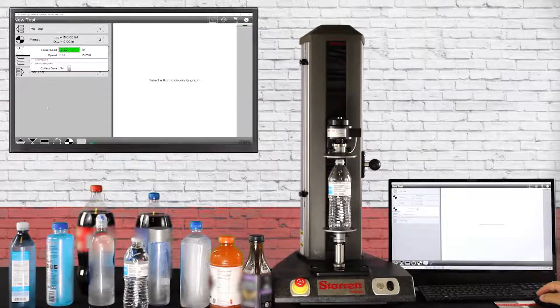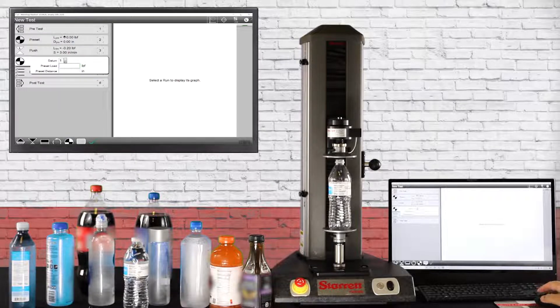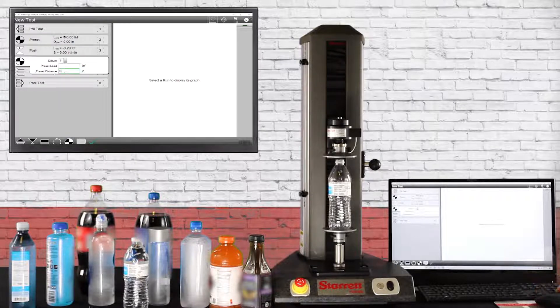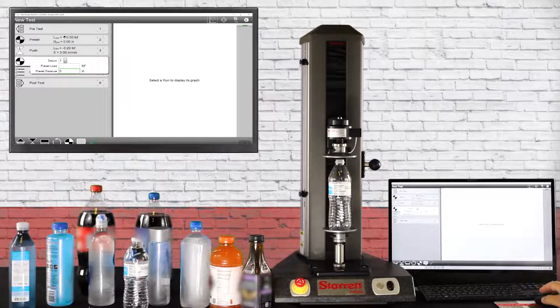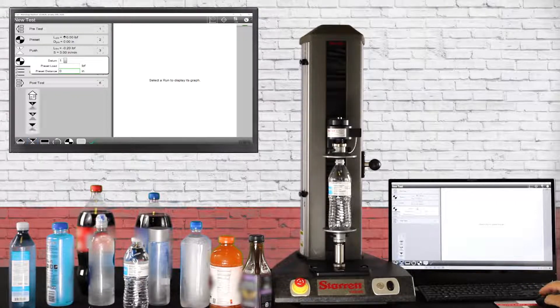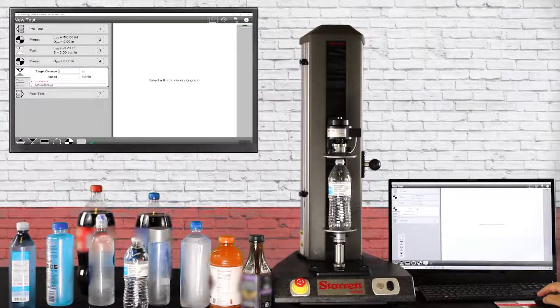Next we're going to do another datum. After we touch the top of the bottle we want to zero out our distance so we're going to put a zero in there and call this datum one. The next step of the program we're going to go to a distance, the target distance is going to be 0.25 of an inch at eight inches a minute.